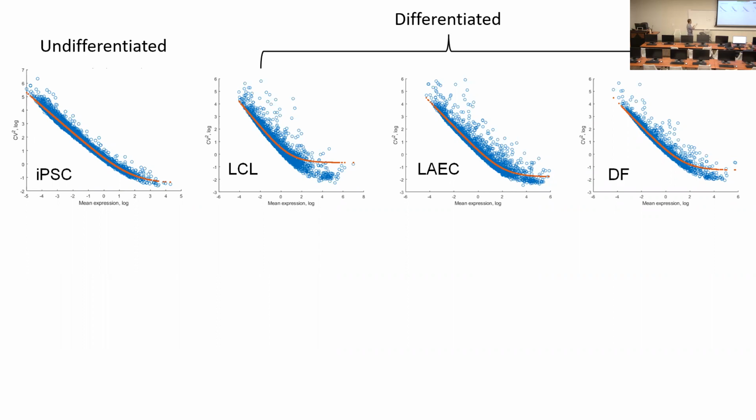So the other way around is, if you look at the highly variable genes in those differentiated cells, those genes should reflect what those cell types are working on.